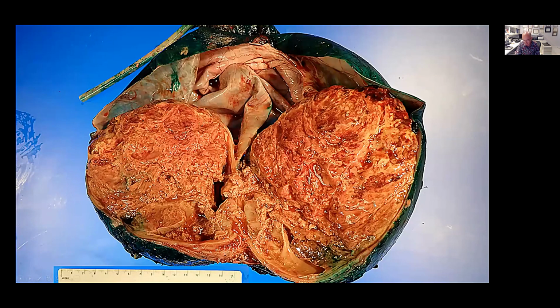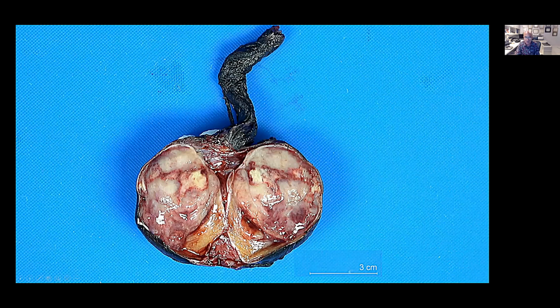And here in this area, there was a possible invasion of the tunica albuginea, but likely not of the vaginalis. So in this case, if the gross examination is not very conclusive, you can say suspicious but not definitive, and then we can confirm it with the microscopic description.